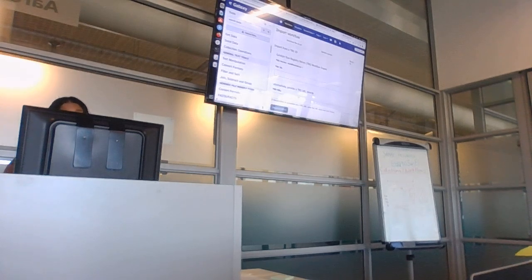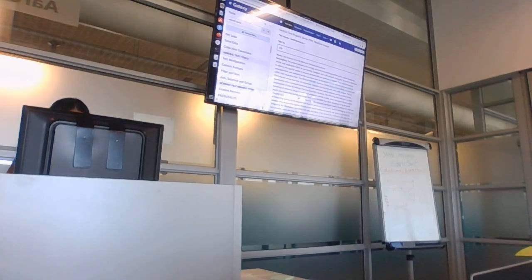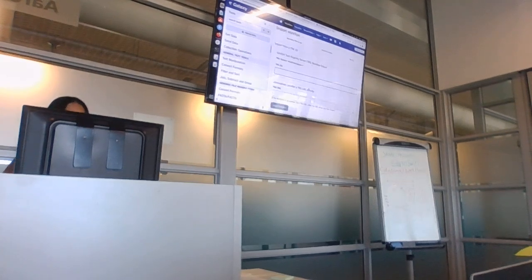If somebody has the TRS ID, I don't have one now, but last time we used the ID. You could also add the ID to here. You can see it starts to populate, and you will be able to find the workflow here as well using that way. But that's the only other thing I wanted to add, and that is also in the notes. You can import workflows.